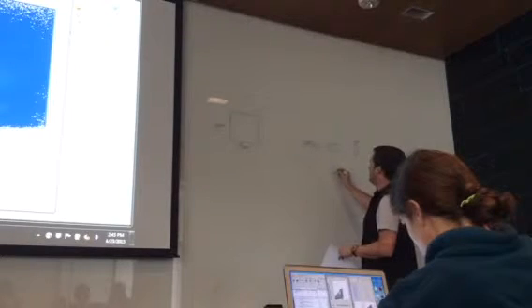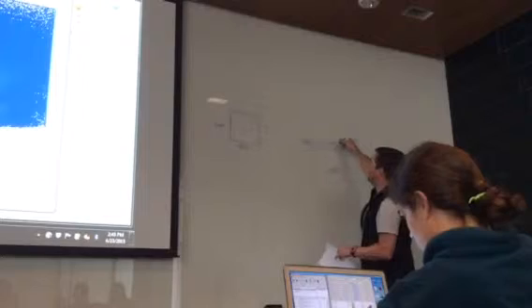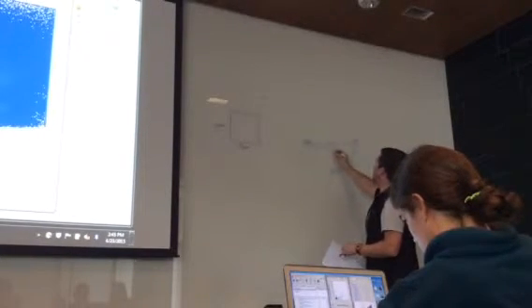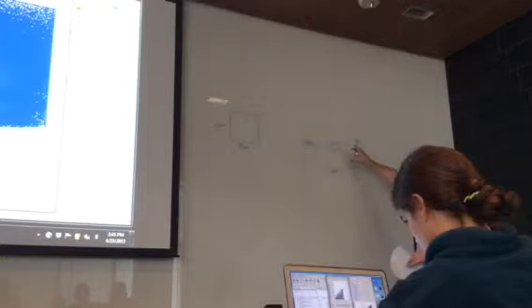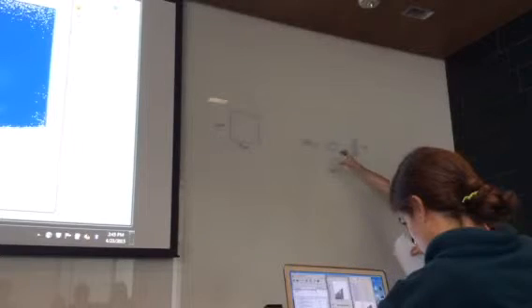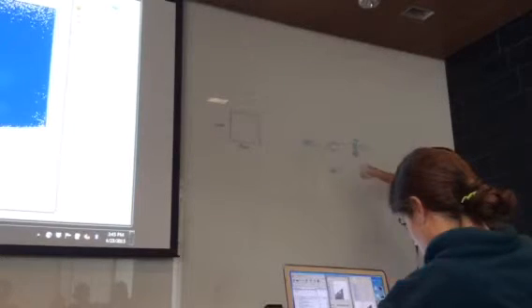This one here is your detector for side scatter. When the laser shines on this cell that's passing through, the laser light passes over it, around it like this. So forward scatter, you can think of as a simple measure of size. It's how that cell kind of blocks the light while it's detected.